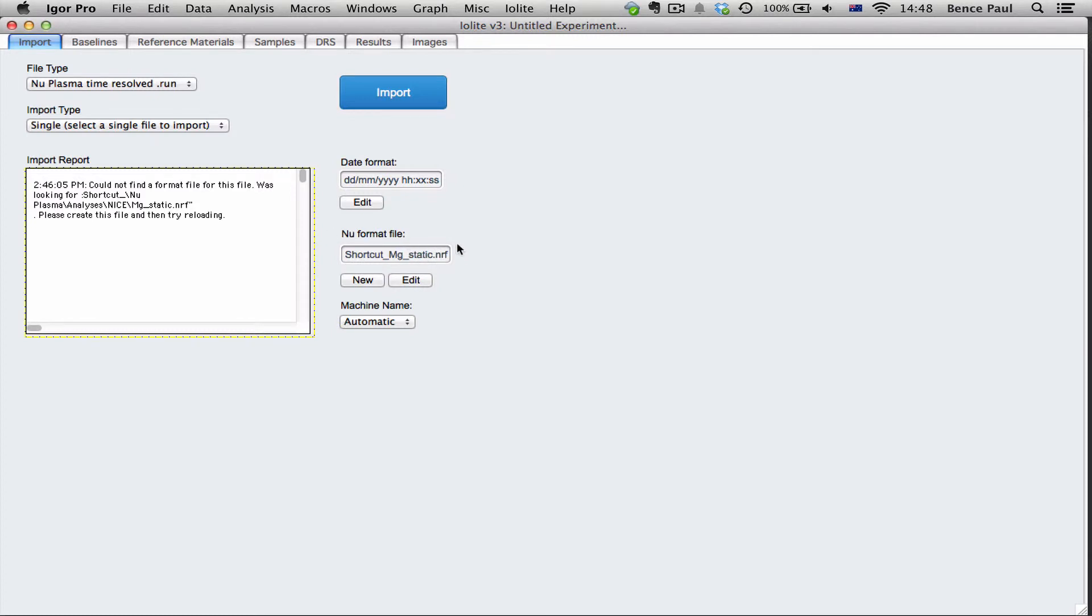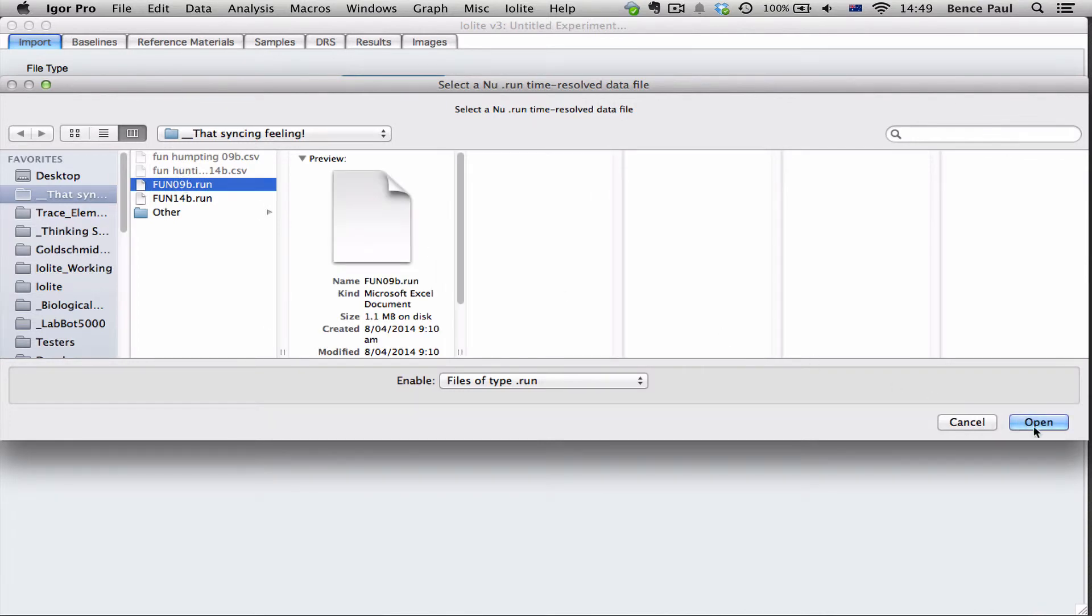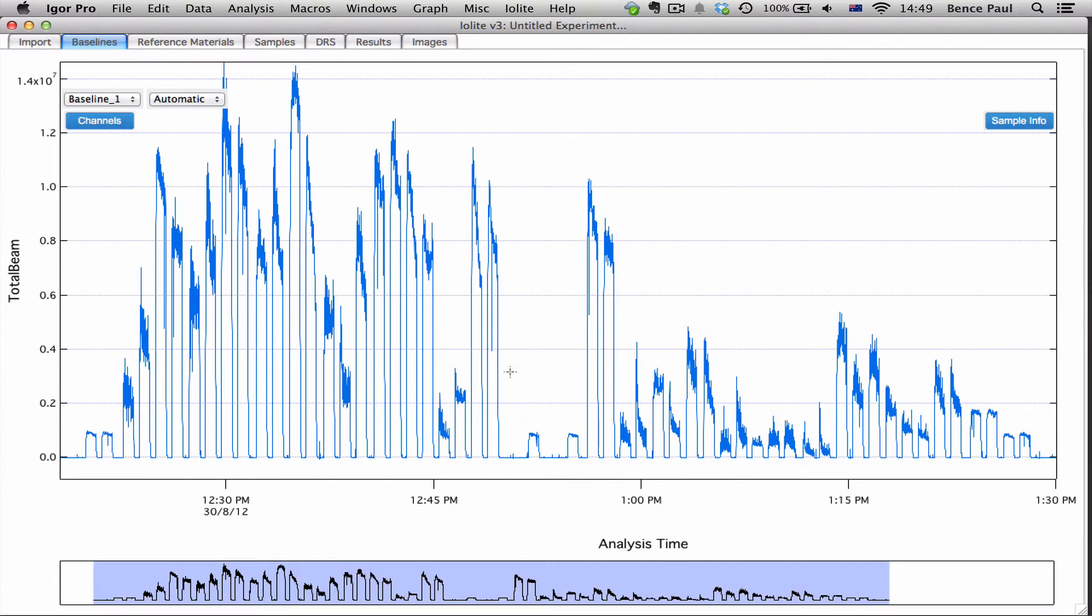And now if we open a .run file that uses that format file and click open, you can see that it now says it's loaded three channels from that file. And when we look in the baseline file you can see that.